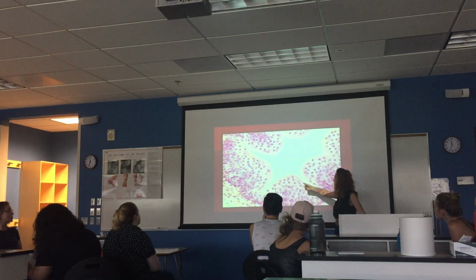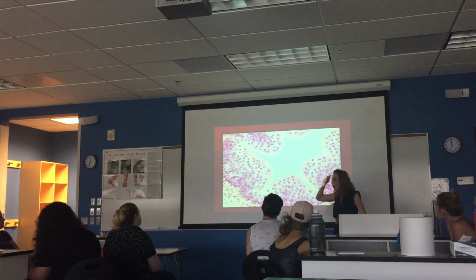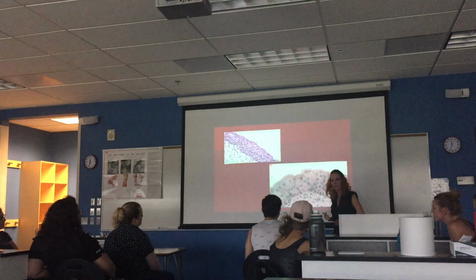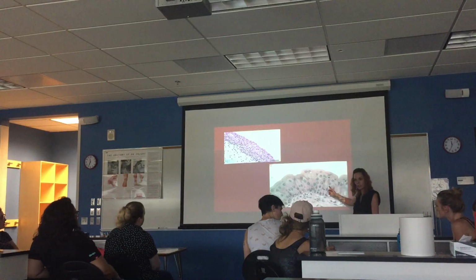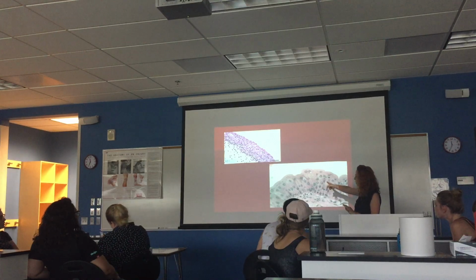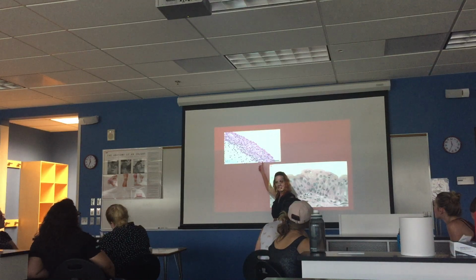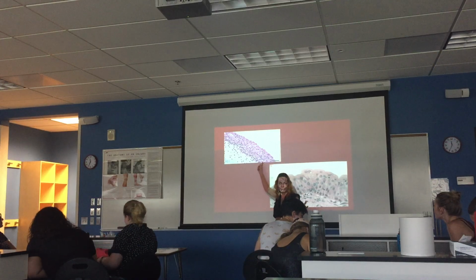It looks like it might be stratified cuboidal, kind of like stratified squamous, but stratified cuboidal. But I know, because I'm smart and I listen to my teacher, that that doesn't exist. Okay? Stratified cuboidal does not exist. So you're going to be like, what is this? I'm going to say it's transitional. There is stratified cuboidal, but it's only 2 layers and it's rare in the body. So when you're calling me over saying, this looks cuboidal, and there's lots of layers, I'm going to be like, yeah, it's transitional epithelium. It has a little bit of that appearance.